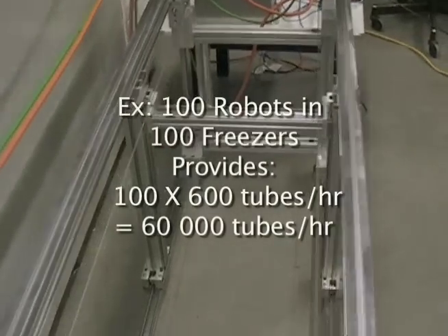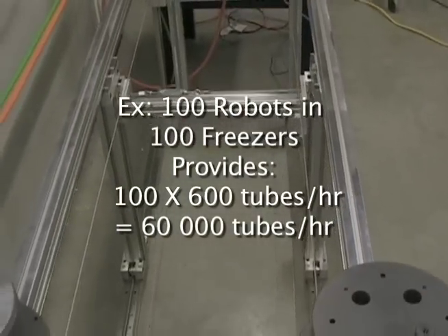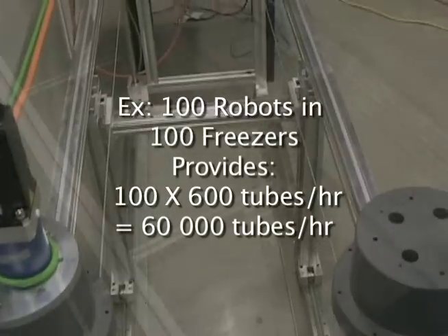Due to the scalable nature of the system, the more freezers and robots that are added, the faster tubes can be picked.